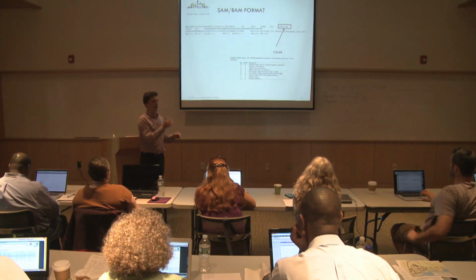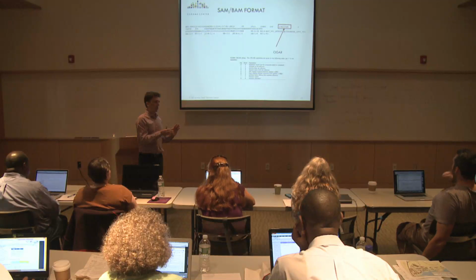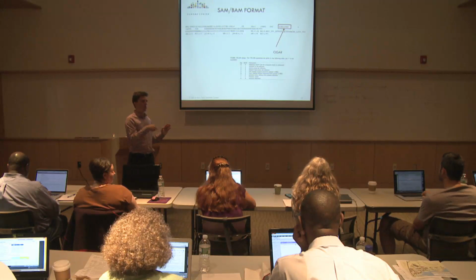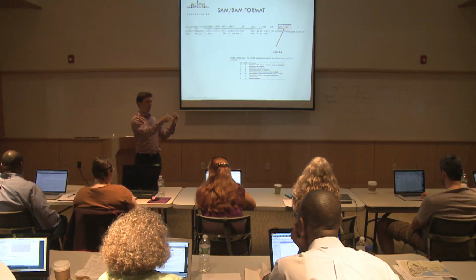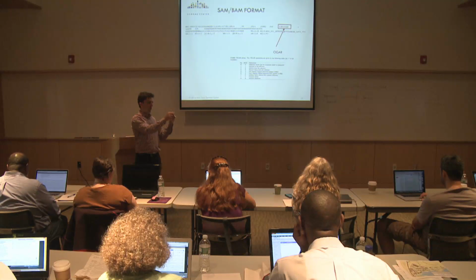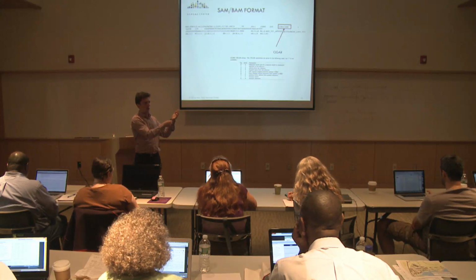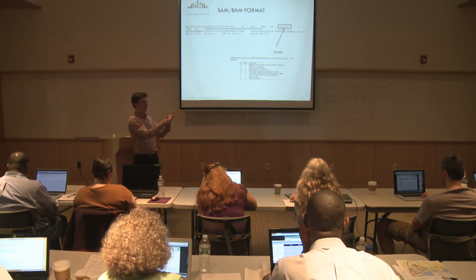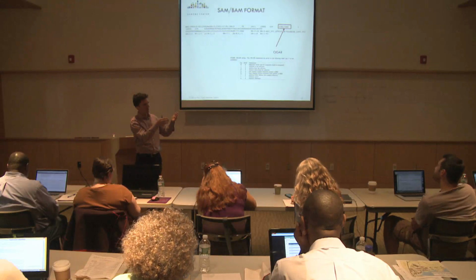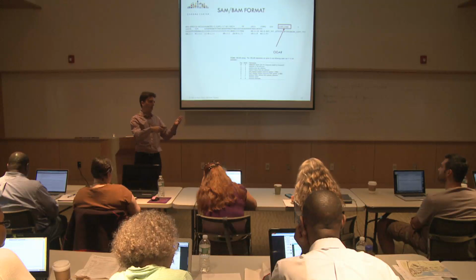But that kind of depends on the aligner as well, so there could be differences here. But the way you do the alignment is really by finding the best possible location and then scoring that. So going over the entire alignment and making a score that gives a positive score for a match and some penalty for a mismatch or for an indel. And so when you have too many of those penalties, you are below a threshold and you don't match, or you don't report that alignment.